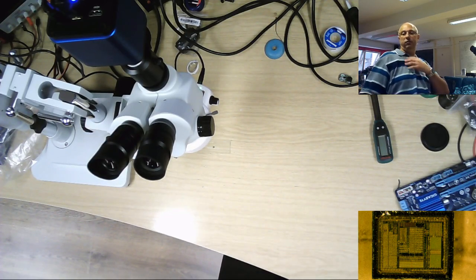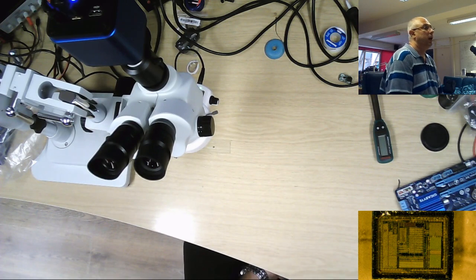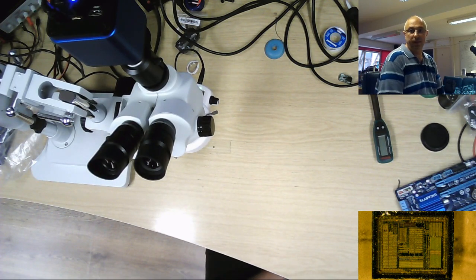Hello everyone, welcome to the video. I'm making this video for a company called HiEar, which I bought their scope camera from — basically just trying to show how bad it is and comparing it with my existing camera for the microscope.